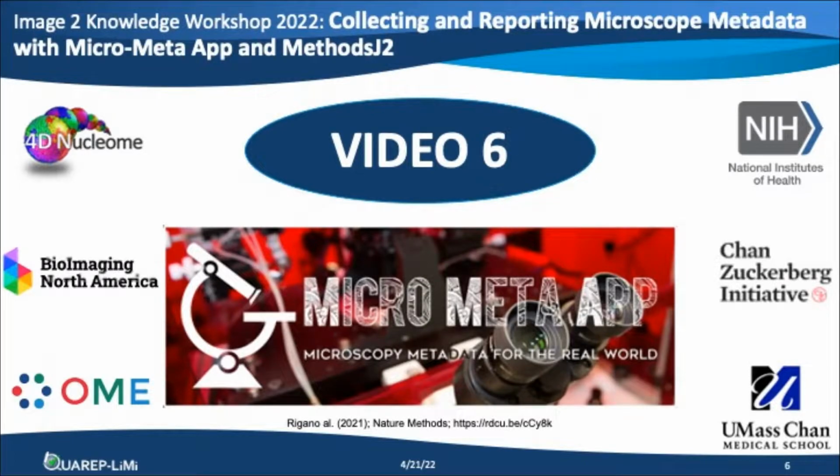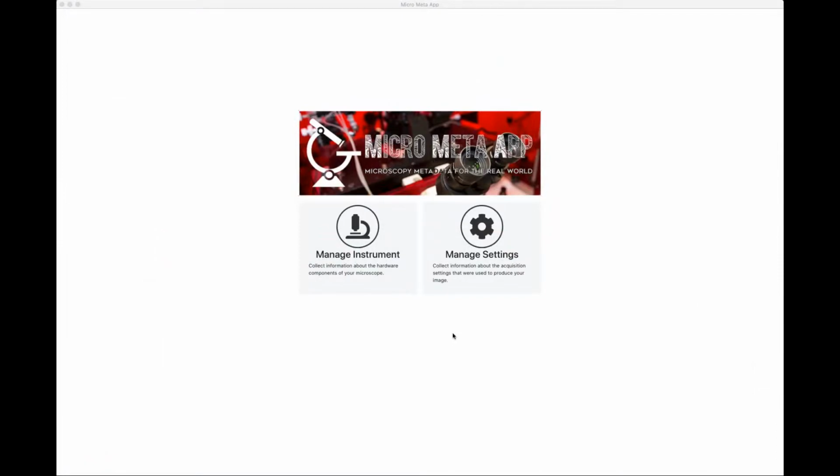In this part of the tutorial, I'm going to show you how to enter into the Manage Settings side of the application and inspect an existing Settings.JSON file to evaluate its content and decide whether it needs further editing. In order to do this, we will take advantage of the files that you should have been able to download from the Zenodo repository following the tutorial instructions.